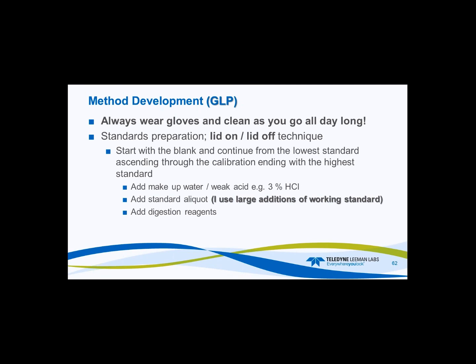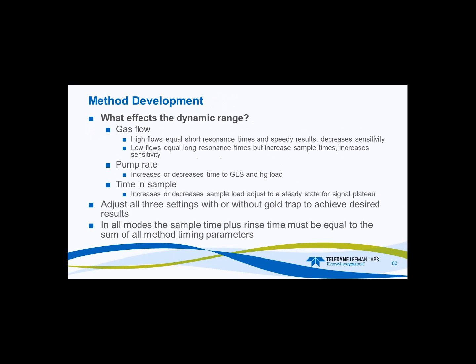So every time I do an addition, the cap to the test tube or the volumetric flask, whatever you're making the standards in, it's always nearby, and then I pop it on to preserve that in between additions so I don't contaminate anything. So a little bit about method development.